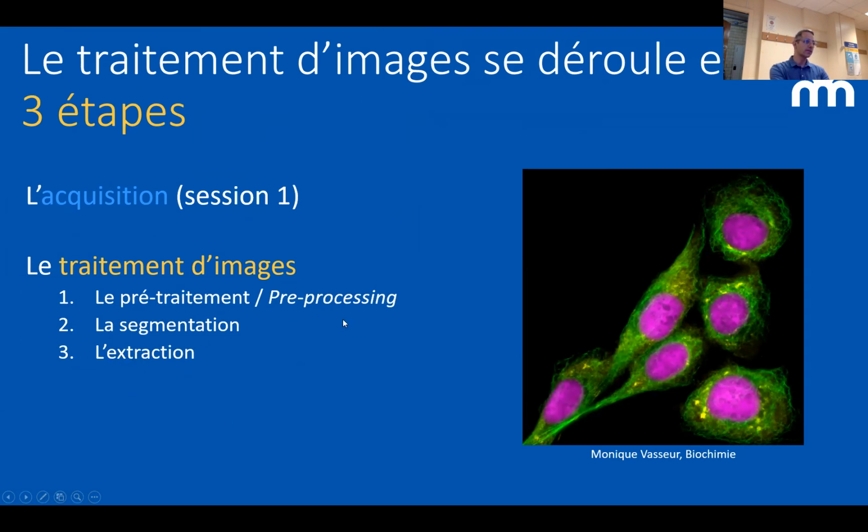The pre-processing is basically everything you do to facilitate the second one. The second one is actually making several sub-regions within your image, depending on what you see on the image. And the extraction is actually getting numbers from the region you drew before. We're going to also see the statistics and the analysis, but this is going to be in the next session.